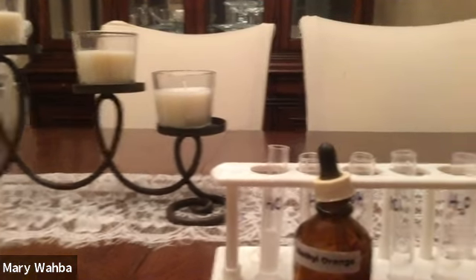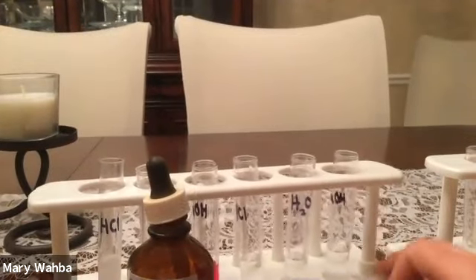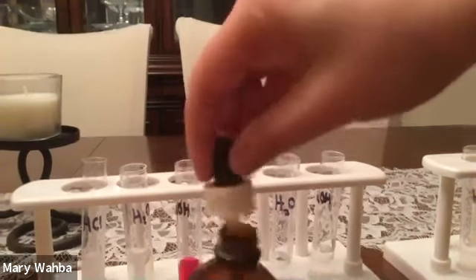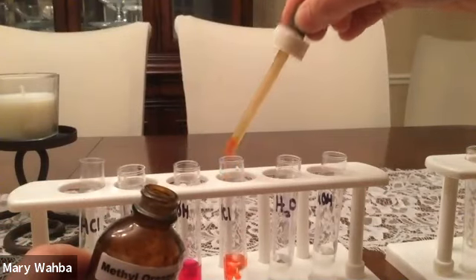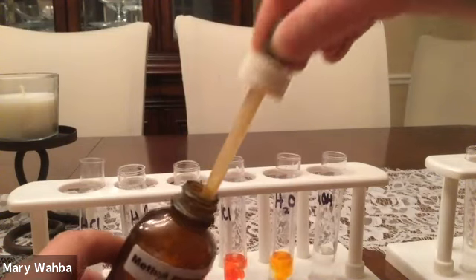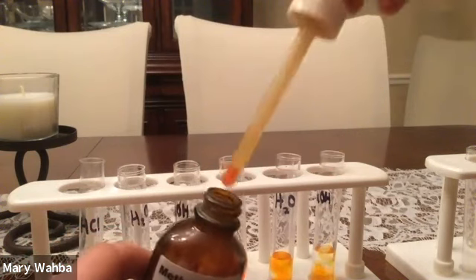So for methyl orange, I'm going to turn to these three right here. And we'll do the same thing. So we're going to use HCl, water, and NaOH. So acid, neutral, and base. And so there's a drop in the acid, neutral water, and the base.